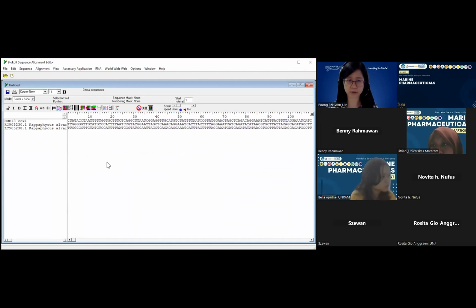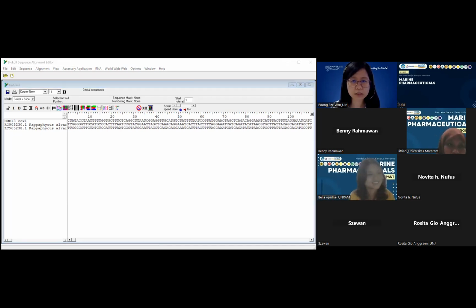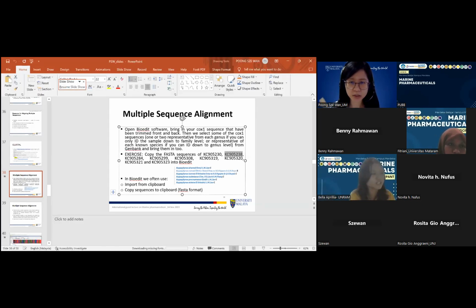So you can carry on with this later. Okay, I will share the slides. You can do this. What I want to tell you next is I need to find the outgroup. So just now I was telling you that the outgroup is something that is distantly related to Kappaphycus. So I will use Eucheuma denticulatum as my outgroup. So let's see. I can't remember which one is denticulatum. Just give me one moment. Let me search.